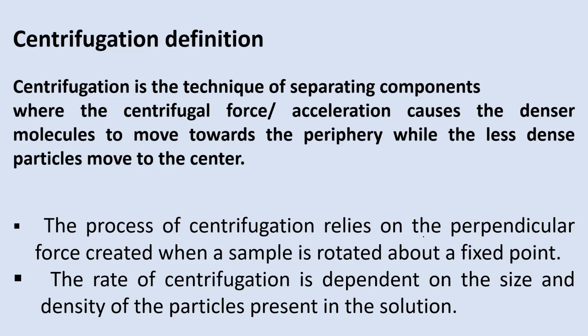The process of centrifugation relies on the perpendicular force created when a sample is rotated about a fixed point. So this is something like... I forgot the name of it. Okay, when I remember, I'll let you know.